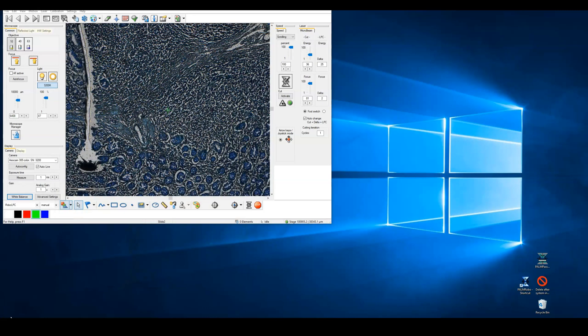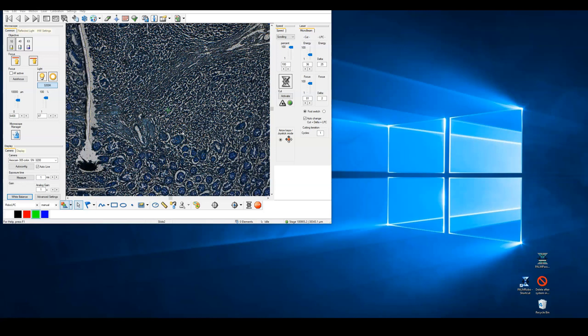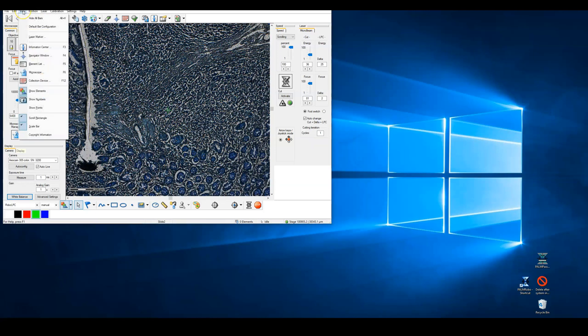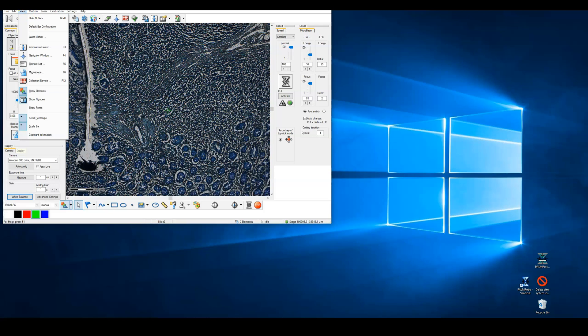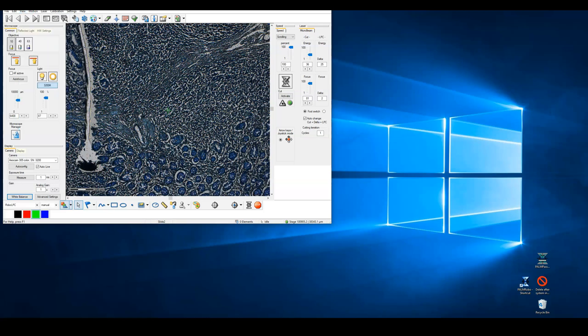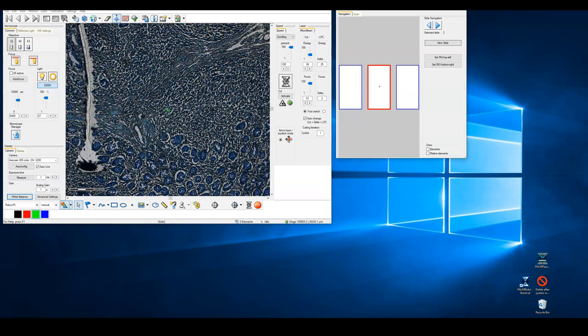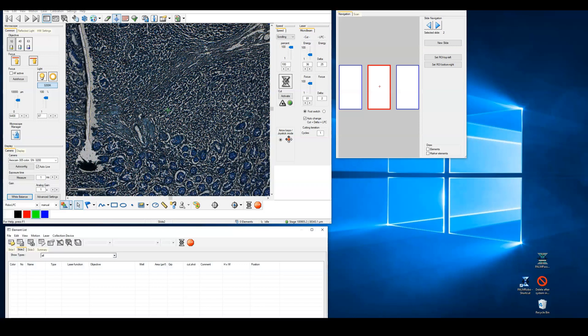With all these checks made, we can start to control the system through Palm RoboSoftware. A proper startup should display this RoboSoftware window and a live image from the color camera. We will additionally want to control the stage movement with the navigation window, view the list of items that we will be cutting, and control the capture device. All of these can be opened under the view option on the file menu bar or you can use the shortcuts F4, F5 and F12.